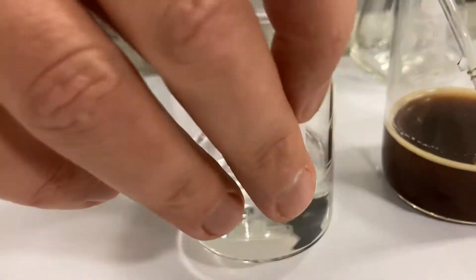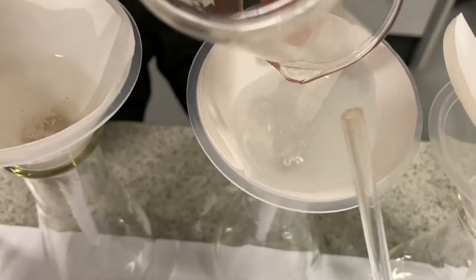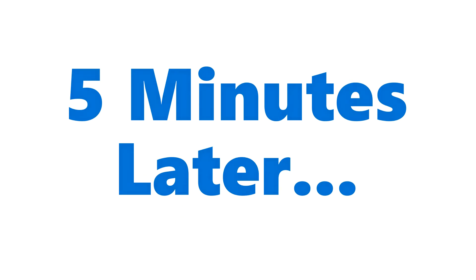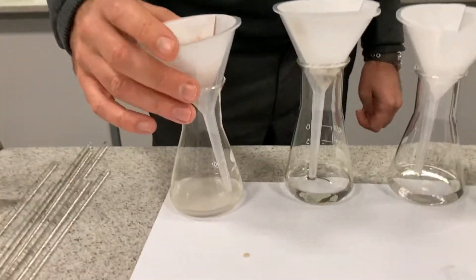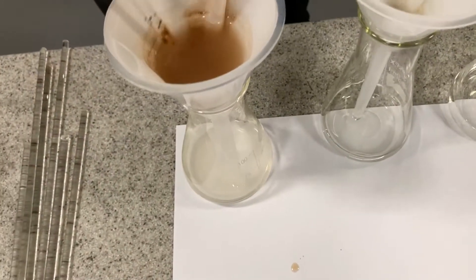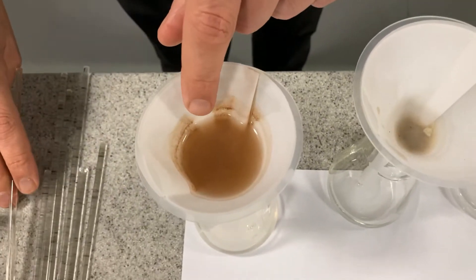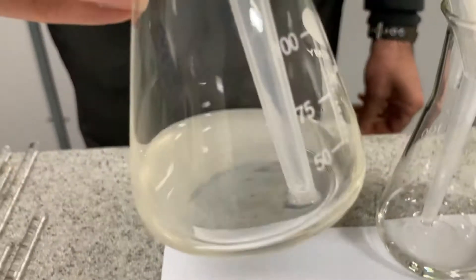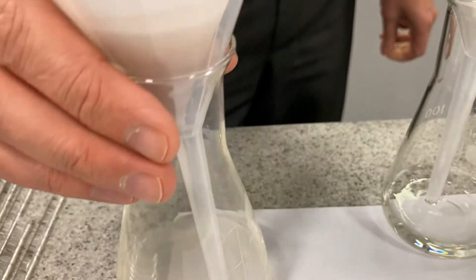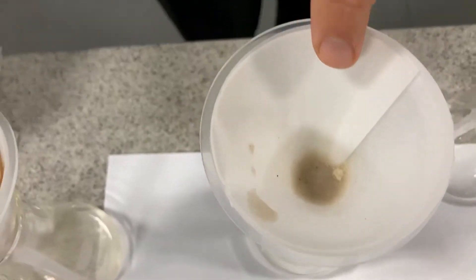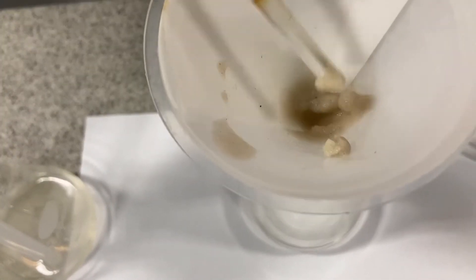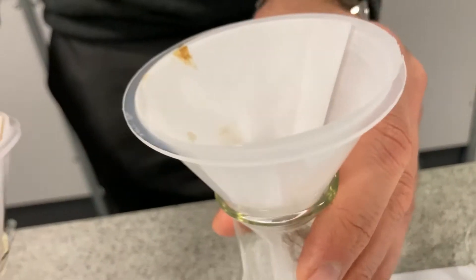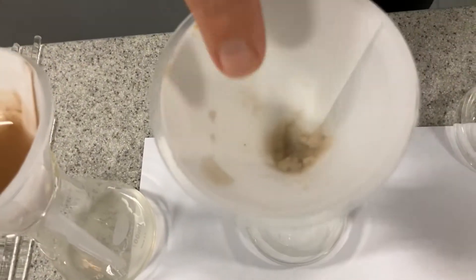The next one I believe is sugar — I'll pour that through and leave these five minutes, then come back to them. So here's the hot chocolate — that's sort of half dissolved and half not, what you call a suspension. Some bits are being left behind — that's called residue — sitting on the filter paper, and some cloudy stuff has come through. This one was sand: you can see the sand just sitting there as residue, and it's clear water at the bottom. The sand didn't dissolve and it got caught in the filter paper.